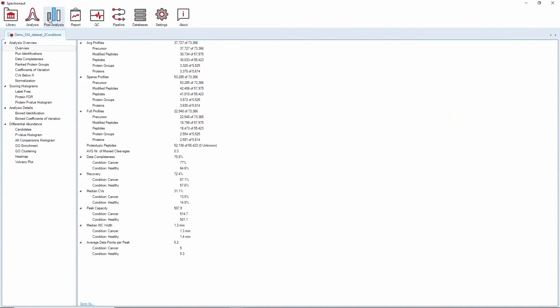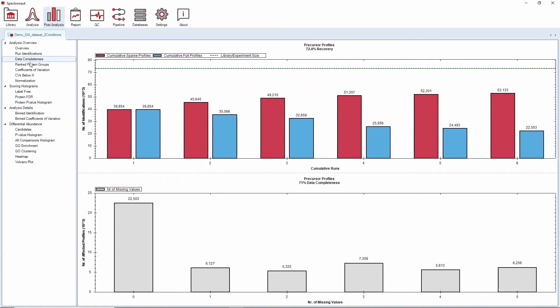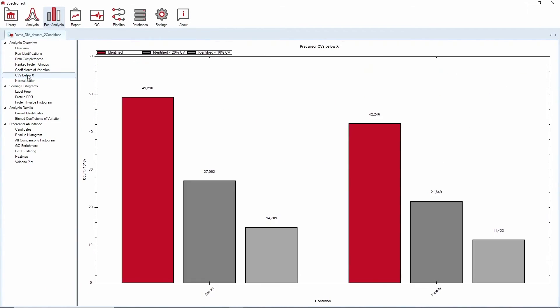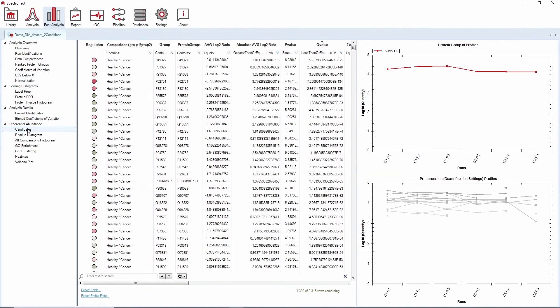In the post-analysis, you get an overview of your analysis and, for instance, on data completeness as well as reproducibility of your measurements. If you have performed statistical testing, Spectronaut will also generate a candidates list.